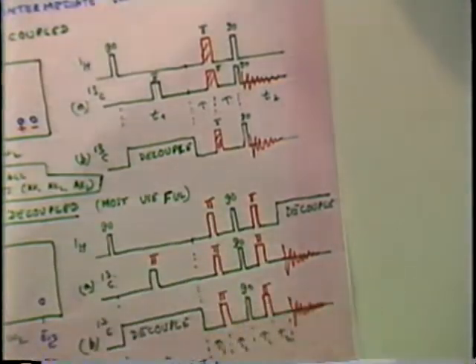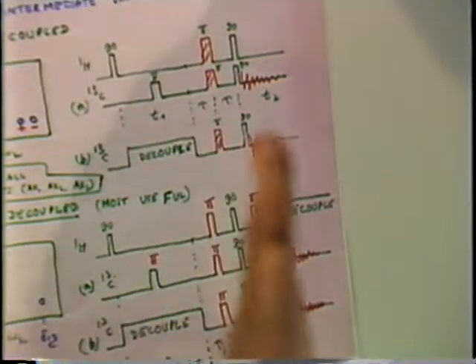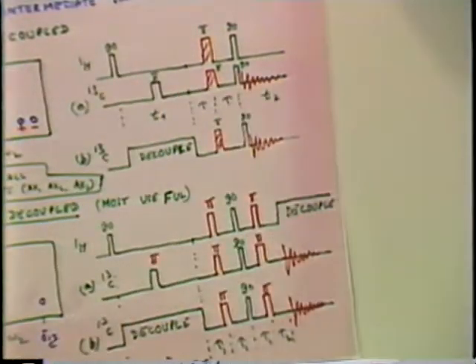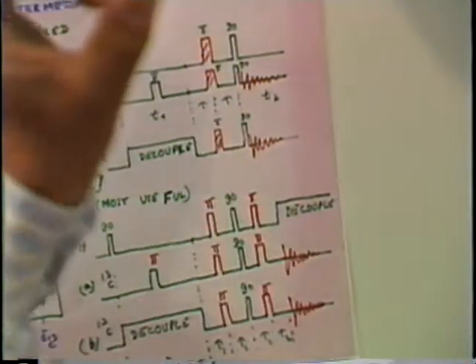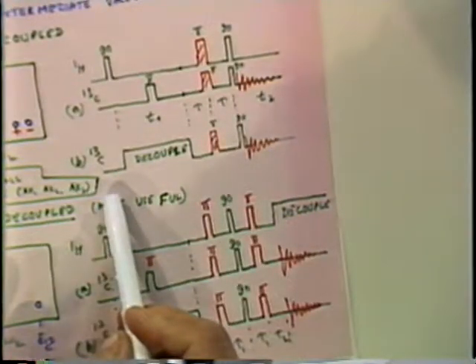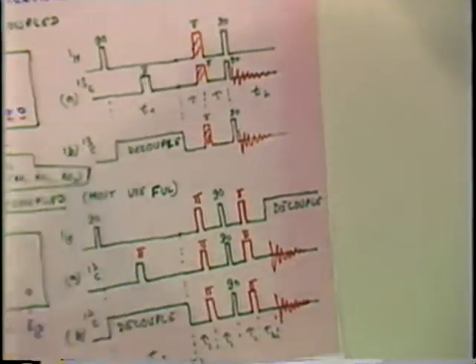Okay? And now how much should be the delay? And this proton is always a doublet. The proton spectrum is always a doublet in the CH2, CH3 cases with the splitting of J. Therefore, this tau is not dependent on CH, CH3, and CH2, and will always be the same. Okay, so this is okay.